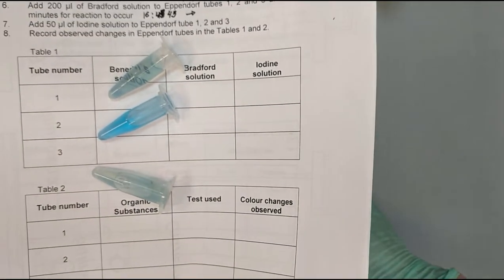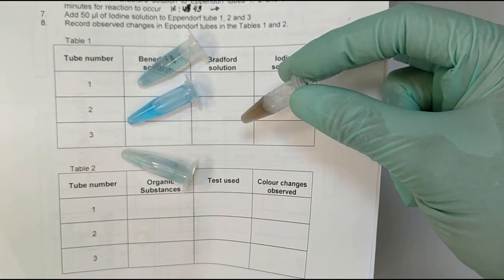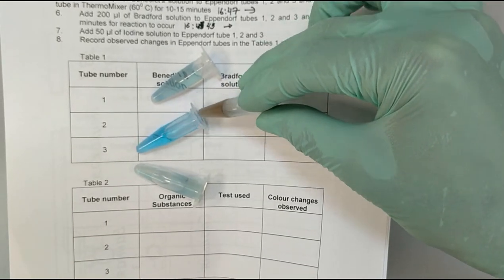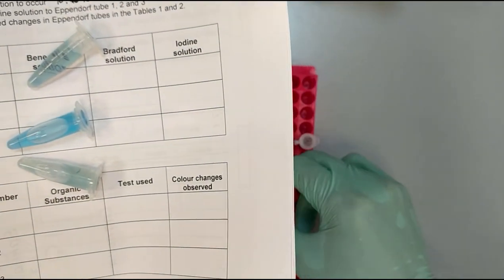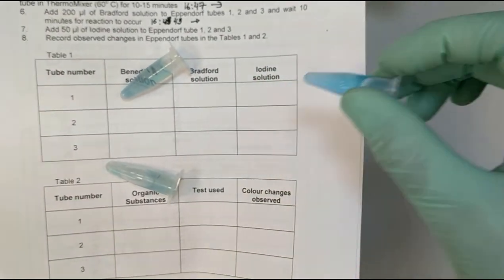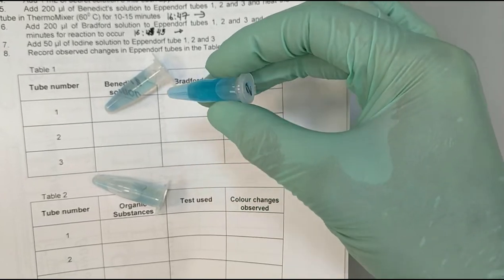So if we look at the color of the Bradford solution, we can see that the real difference is, for example, in the second tube. So the reaction with the Bradford solution happened in the second one.